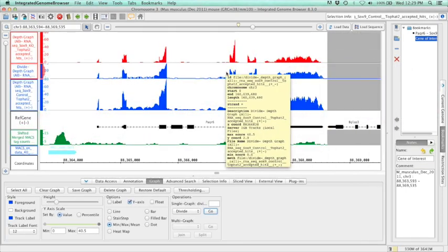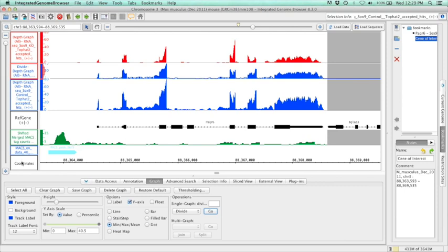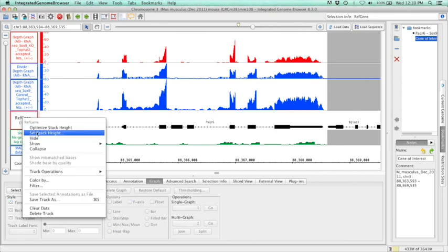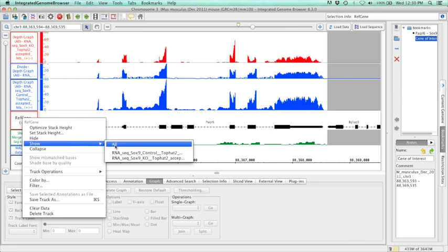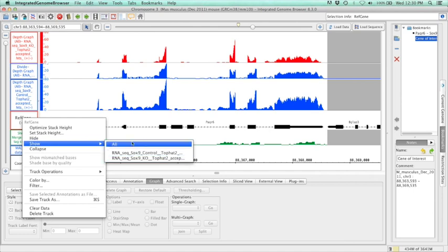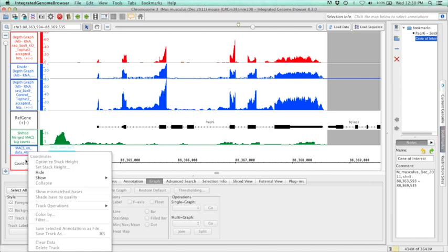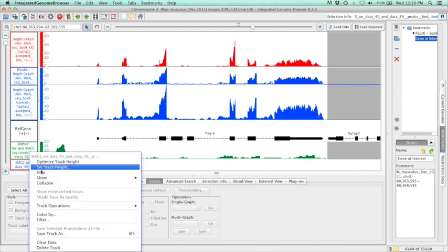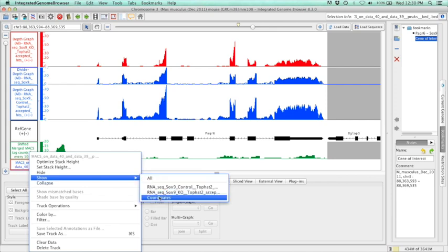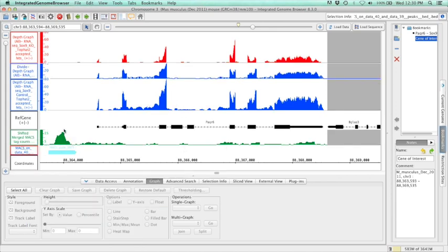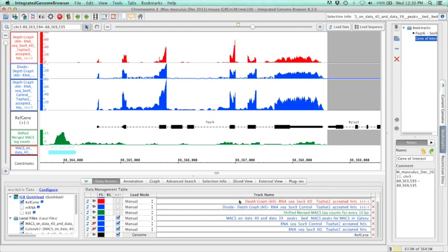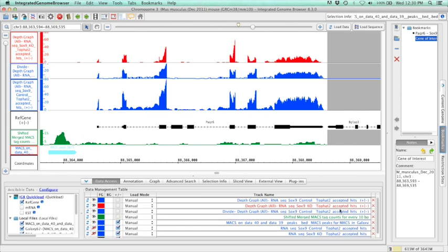Raj asked how to bring back the coordinates in IGB — right-click over in the tracks area, go to show, and whatever you've hidden will be listed there so you can select individual items or select all. Anne brought up a good point about renaming tracks: come down to the data access tab, find the track name field, and change it to something shorter, like 'MACS tags' or 'peaks,' which is useful when taking images with labels.